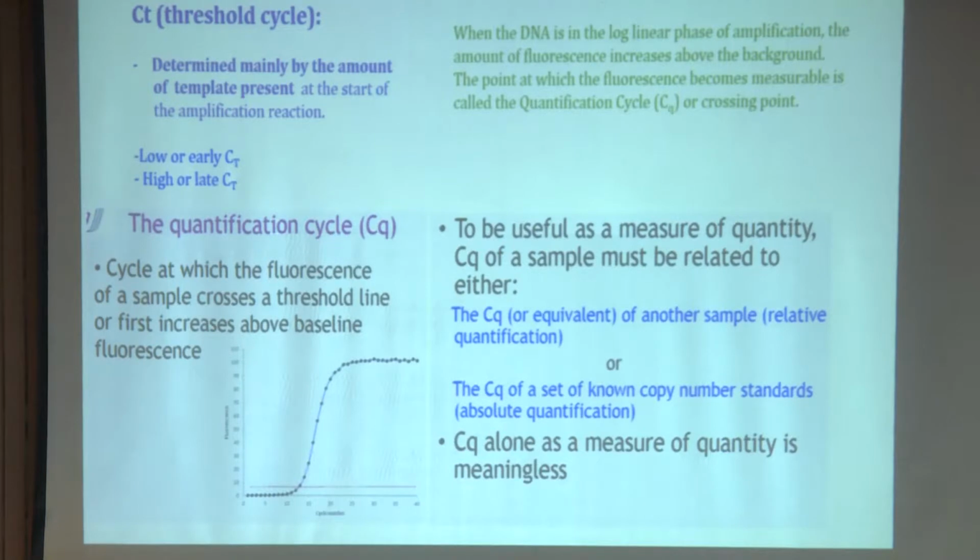So these are the two things you should be very careful about, because a low value doesn't give you the idea of fewer templates, or a high value the other way, right? This is one fundamental issue which you should take note of.